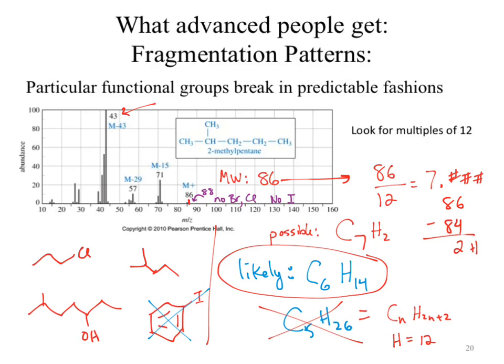So there's never, with chlorine, because you have it as an example, and there's no M+2? There's no M+2. There's always an M+2 with chlorine. Yes. You'll see that 1 to 3. So if you have an M+2 that is like 2/3 or so, how would you classify that? Would that be more considered a bromine, or would that be more considered a chlorine?